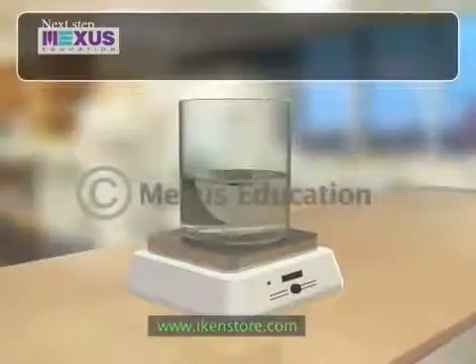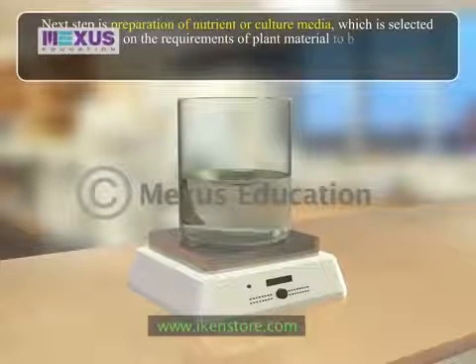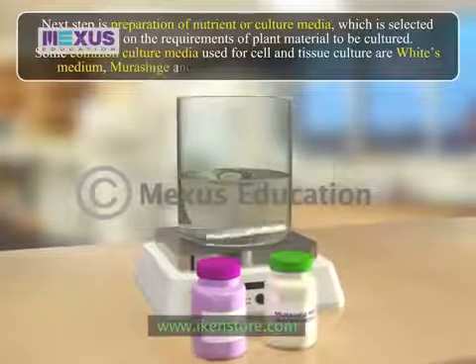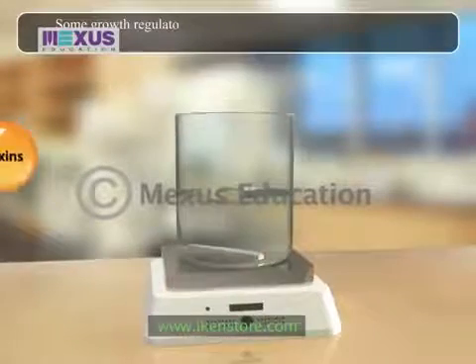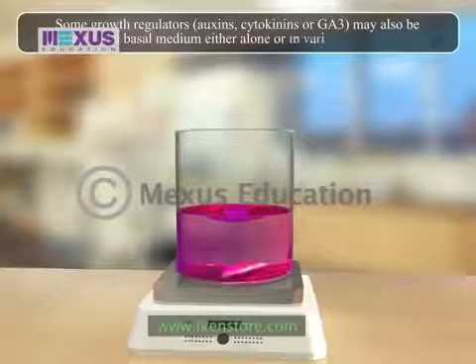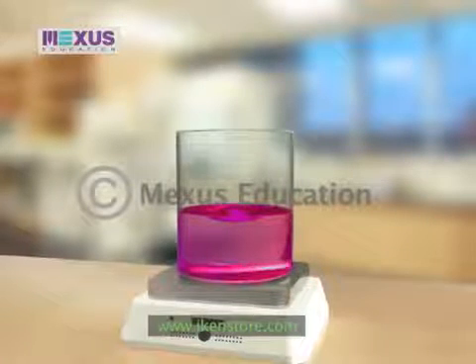The next step is the preparation of nutrient or culture media, which is selected depending on the requirements of the plant material to be cultured. Some common culture media used for cell and tissue culture are White's medium, Murashige and Skoog's medium and Nitsch's medium. Some growth regulators like auxins, cytokinins or GA3 may also be added to the basal medium, either alone or in various combinations. Natural plant extracts like coconut milk and fruit juices are also used in the basal medium for growing tissues.